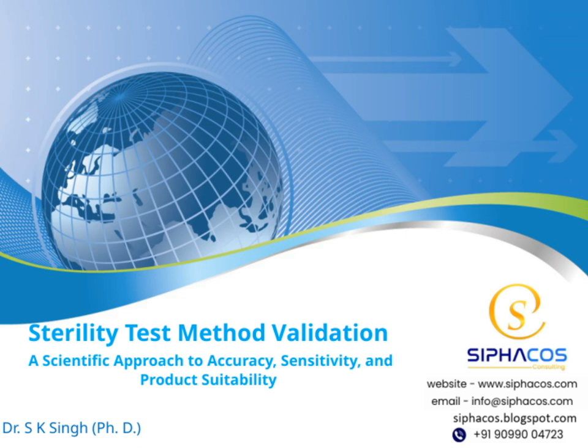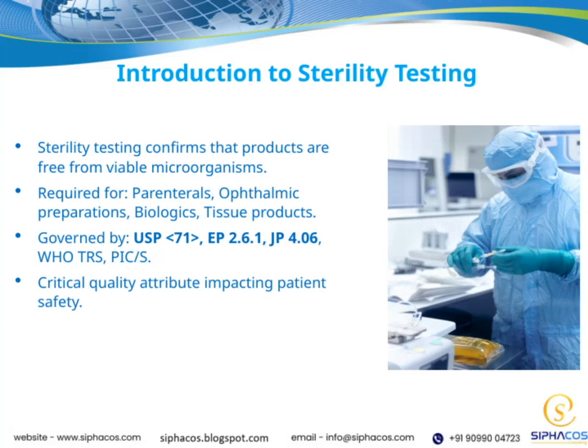Let's get started. Sterility testing is a crucial process that confirms our products are free from viable microorganisms. This step is essential for ensuring safety and efficacy, especially for products like parenterals, ophthalmic preparations, biologics, and tissue products.